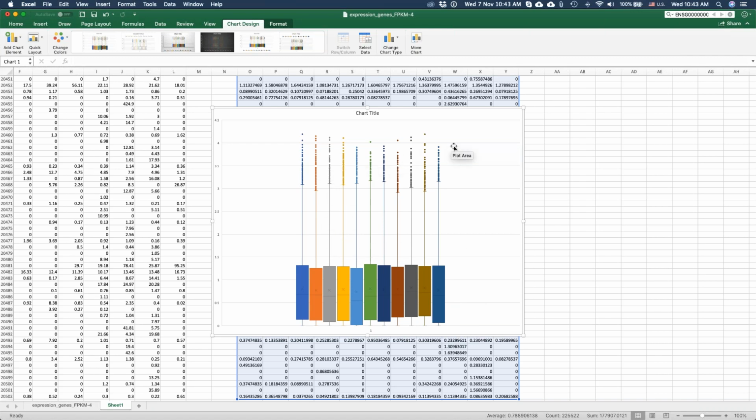We haven't really changed it that much, but we do see that we observe more of those smaller values, which means that they will have a greater significance in our downstream analysis. So logarithmic scale is very useful for us. And logarithmic scale allows us to really appreciate those low values and the high values and kind of stretch it out so that we can see a greater detail of what's going on in our data.